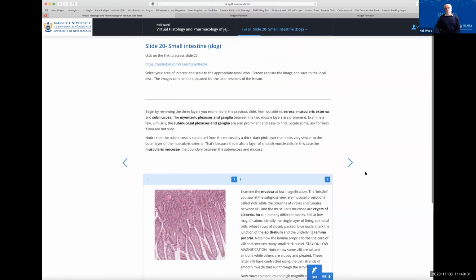So we then move through bigger doses of adrenaline, atropine injection to show competitive blocking action. We did a dose response curve on the atropine dose. Eserine was an interesting one. That's just simply to show the abolition of the cholinesterase and a slow but progressive increase in contractility due to the accumulation of endogenous acetylcholine. So that's a classic sort of message there as well.